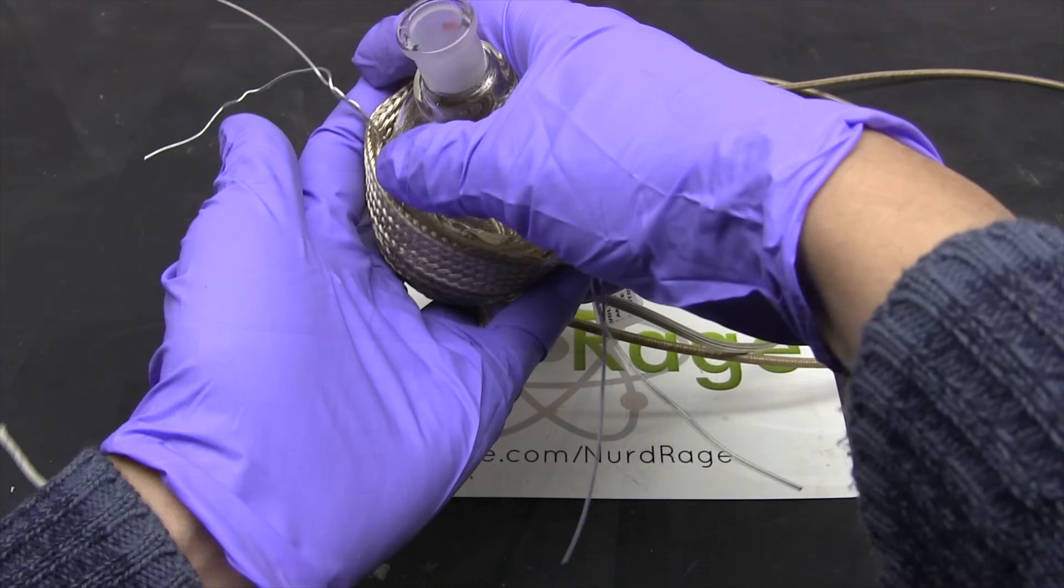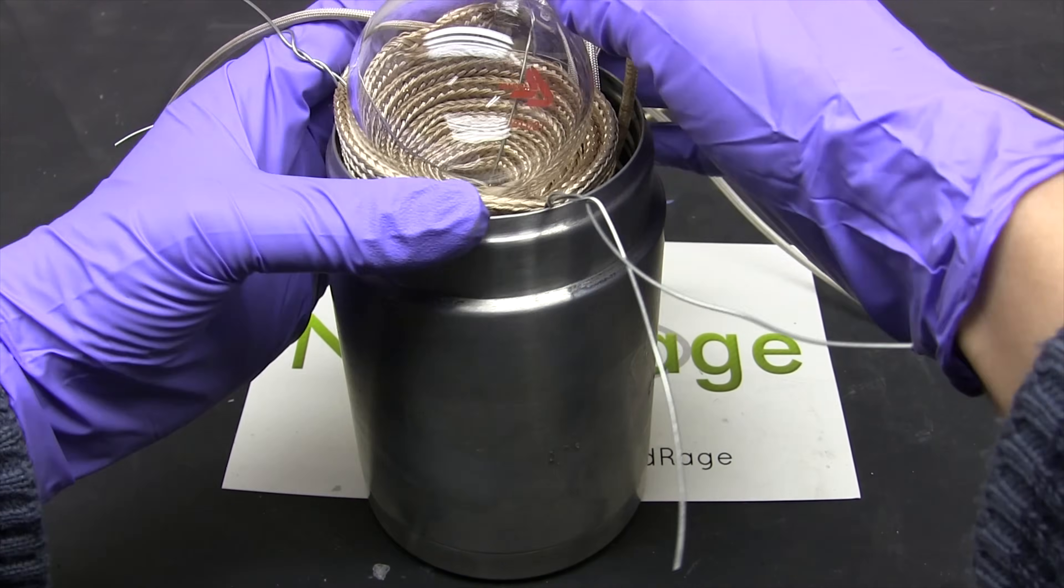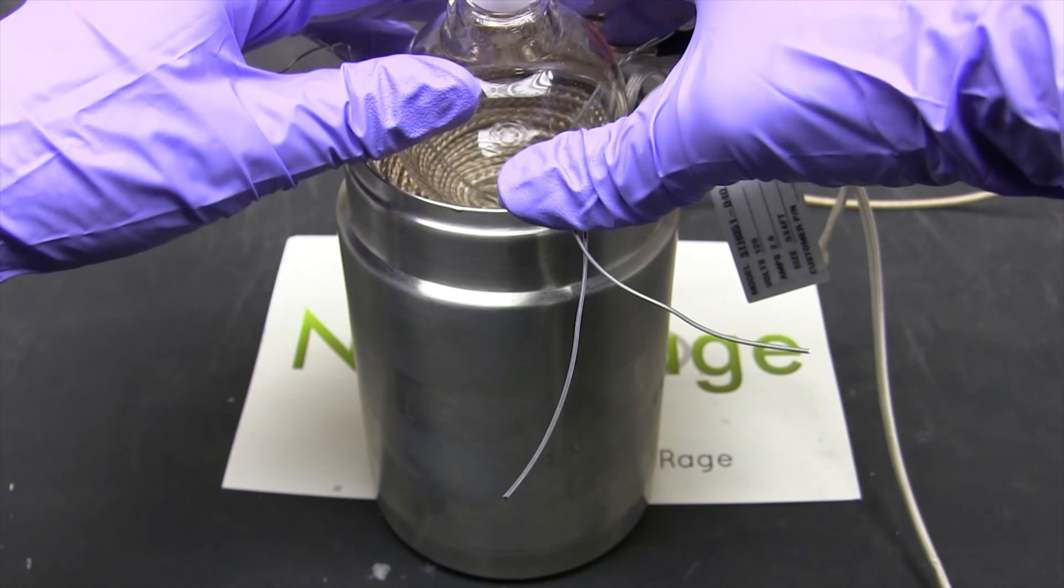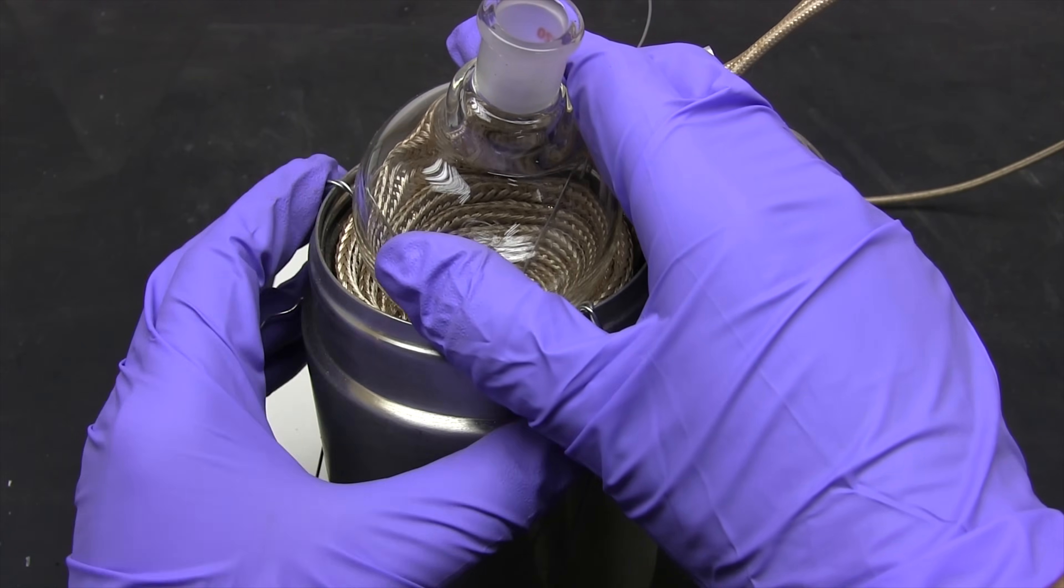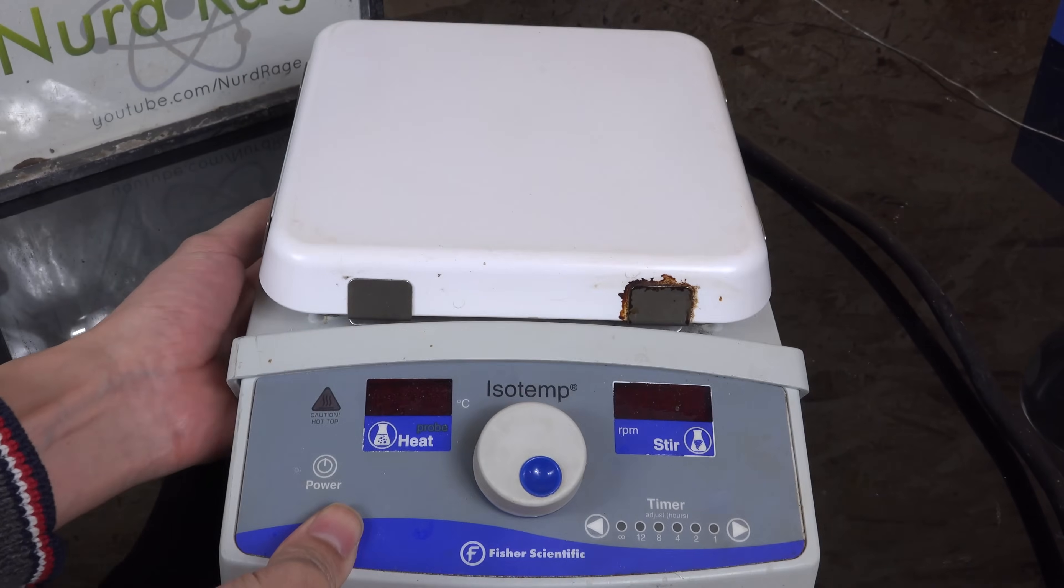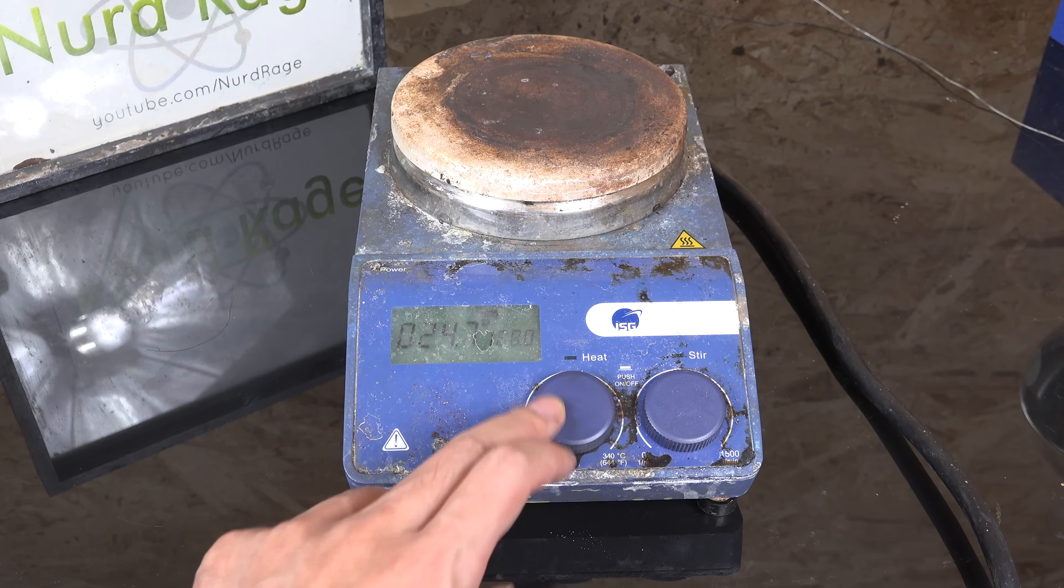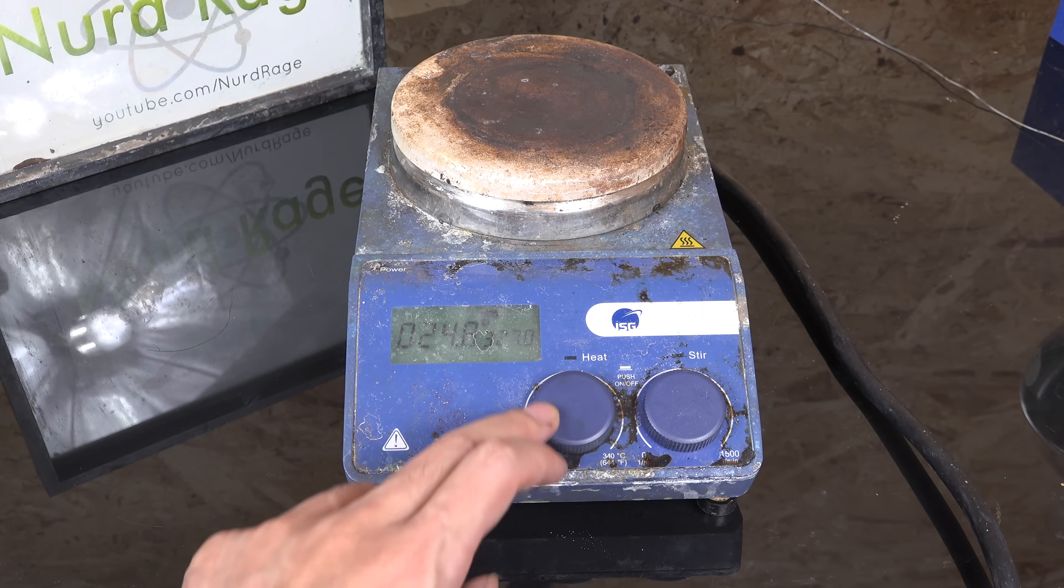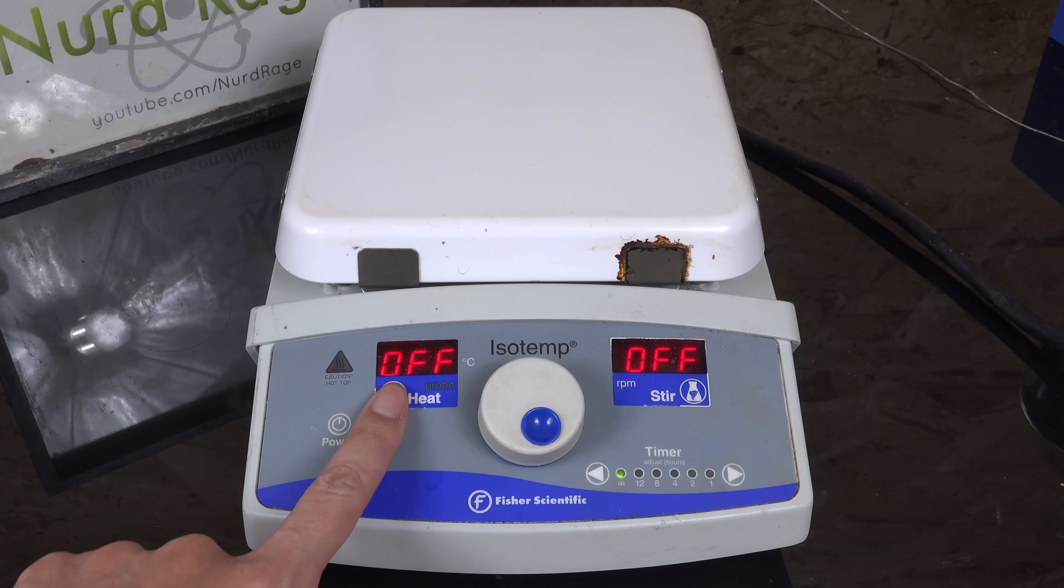First is the heat source. In my previous video we used a high temperature heating mantle that we built ourselves out of heating tape and a thermos. It worked well but I have since upgraded to a ceramic hot plate stirrer. I can't use the standard aluminum hot plate stirrer because those are limited to about 300 celsius or else the aluminum starts to soften. But ceramic hot plates can go much higher and this one can reach 540 celsius, well past the boiling point of sulfuric acid at 337 degrees celsius.